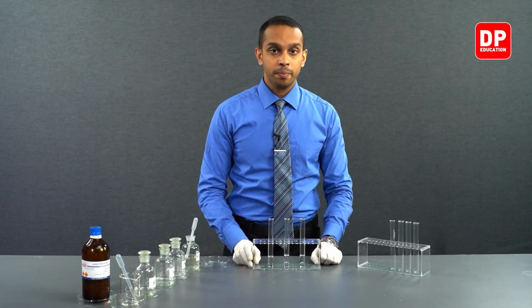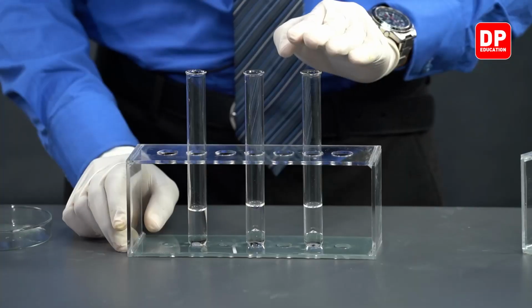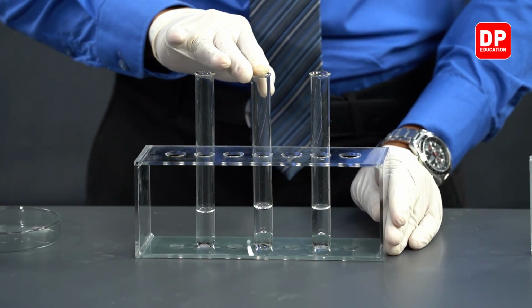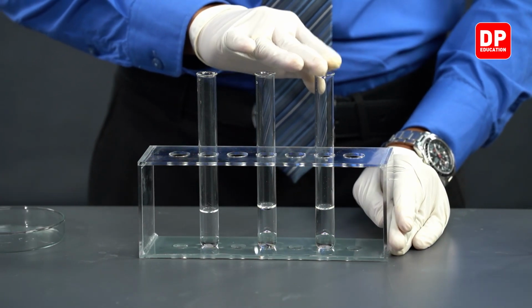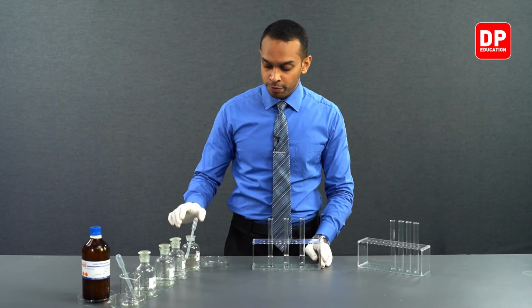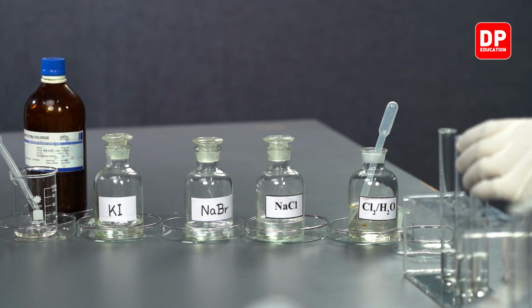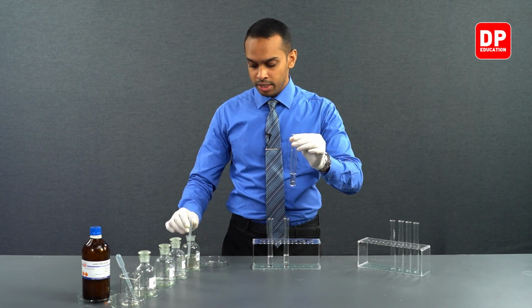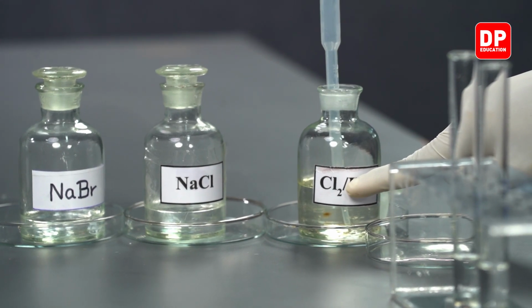Now students, we will be starting from potassium iodide and will be moving on to sodium bromide and sodium chloride, and we will be adding a little bit of chlorine water starting from potassium iodide. So let's take potassium iodide with carbon tetrachloride over here, and let's add a little bit of chlorine water.